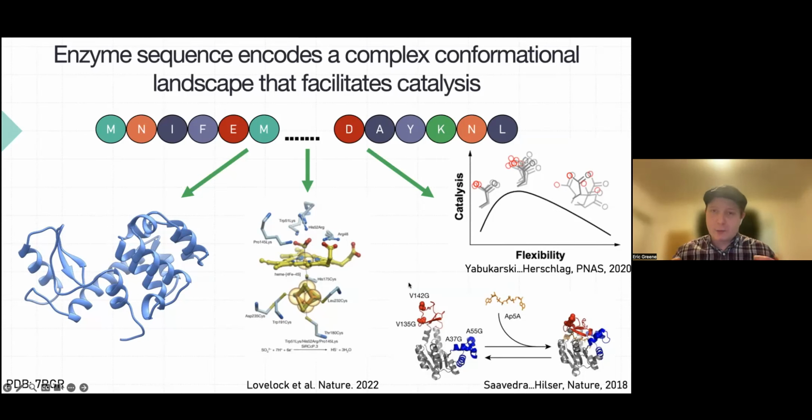And I think one of the areas that is needed in cryo-EM studies is to really look at these dynamics under catalysis and to understand how these play a role in actually facilitating what enzymes do.